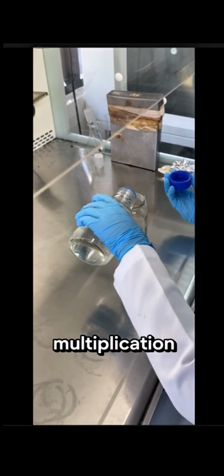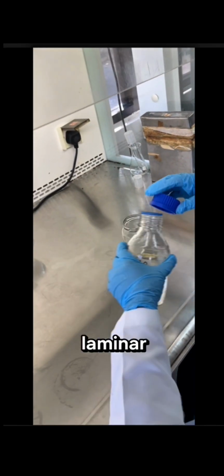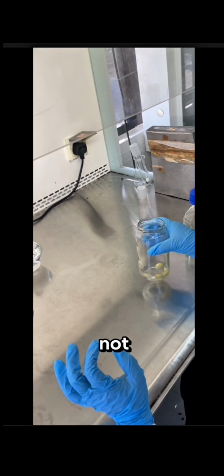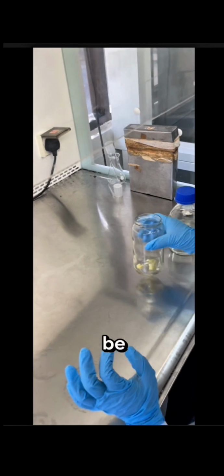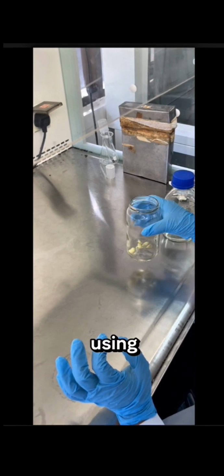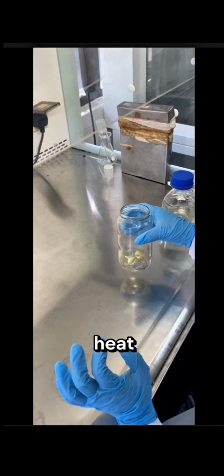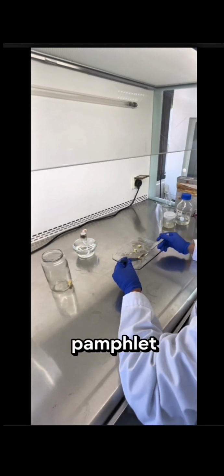Next process is multiplication. Using 70% ethanol, the surface of the laminar flow will be sterilized first, but make sure that the ethanol does not contact the filter of the laminar flow. Next, the ginger and the media bottle will be put in the laminar flow, and the bottle sterilized using ethanol. After that, the scalpel will be heated and then used to cut the ginger plantlet.